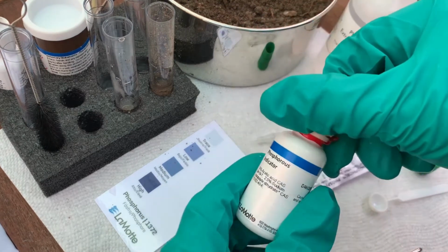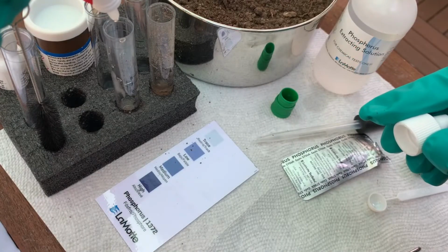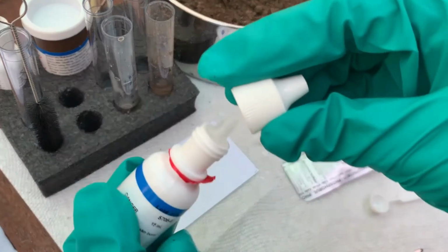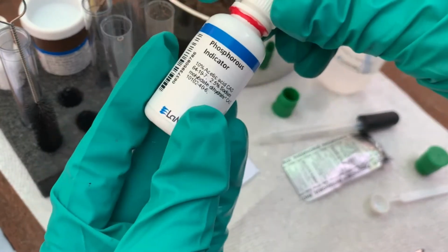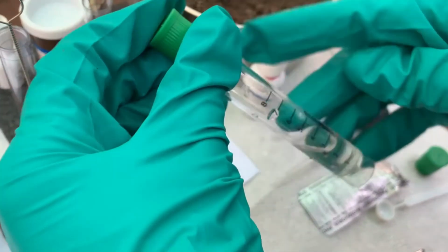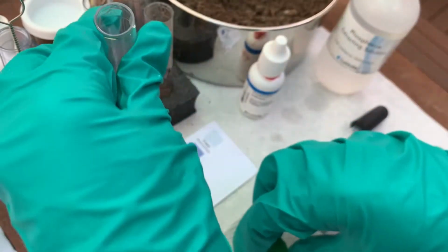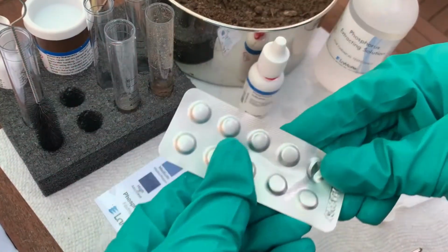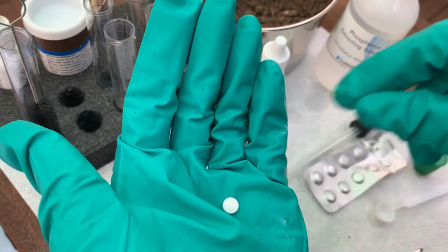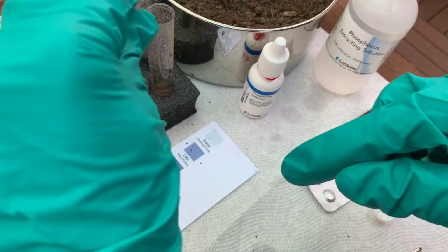Now we take the phosphorus indicator reagent. We're going to add 6 drops to the soil extract in the second tube. Now you want to cap this, and we're going to gently mix it. And then we add 1 phosphorus test tablet. It should be white in color. Drop that in the test tube, and now we will cap it again and mix.